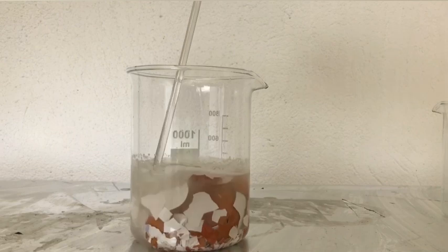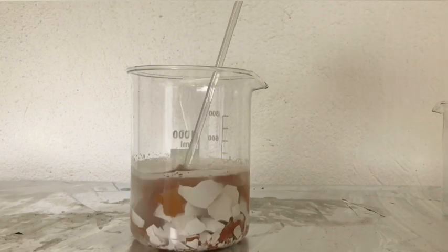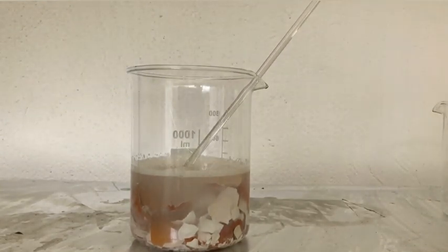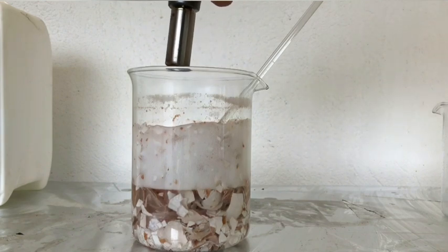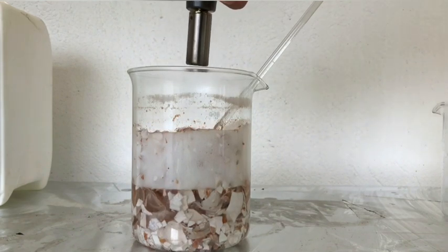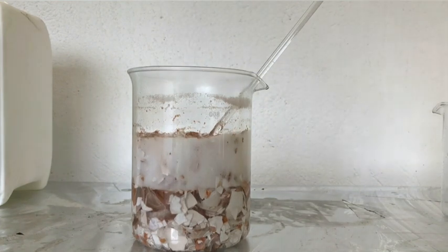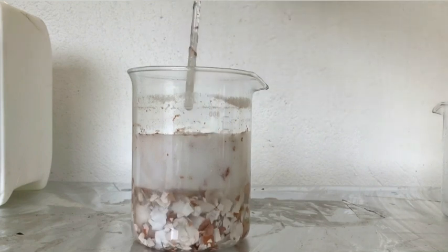The beaker was left to stand until everything had dissolved, and this might take a while — at least two hours. To prevent the beaker from overflowing, I occasionally used a blowtorch to keep the foam down. This actually works really well, and because we got a large excess of acetic acid, the small amount that evaporated and formed acetone didn't matter.